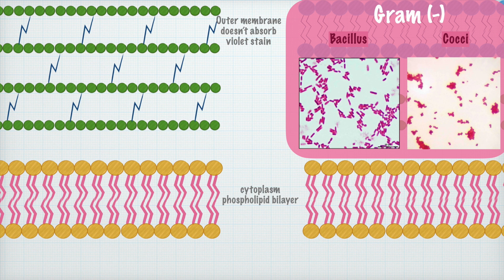And again, you still have the same basic types of structure. You still have bacillus, you still have cocci, you still have staph, and you still have strepto. But the difference in these two different classes of bacteria is in the outer layers. Depending on what type of outer layer it has, it will either be gram-positive, which means it absorbs the initial stain, the purple, or if it doesn't have the thick peptidoglycan, then it will not absorb the purple, but it will absorb the pink, being gram-negative.